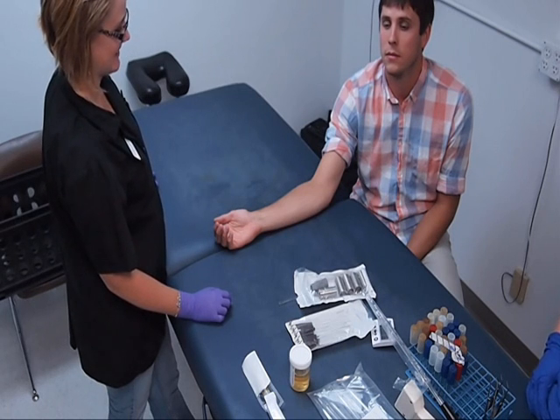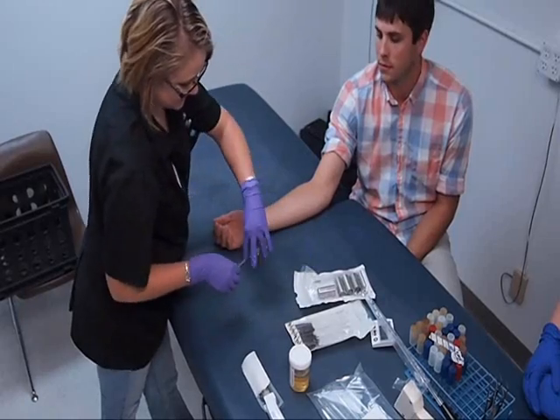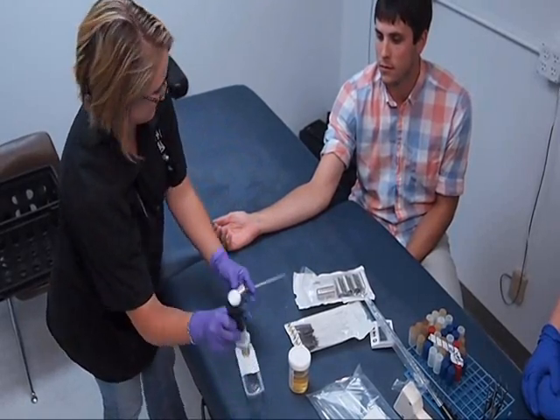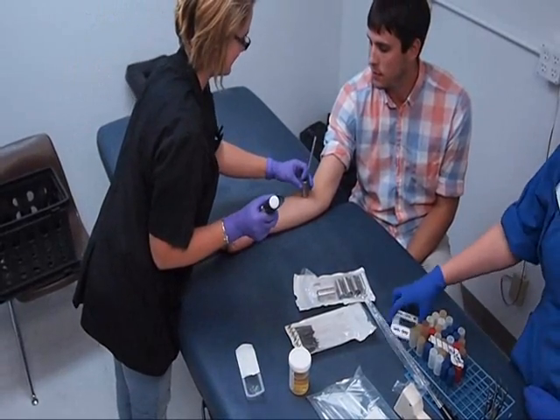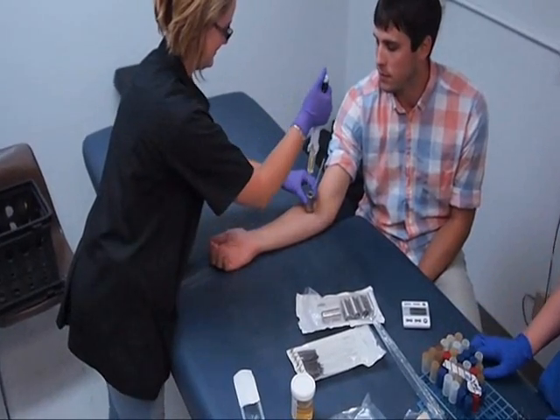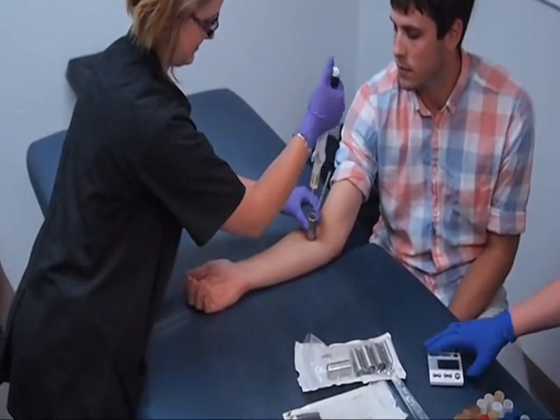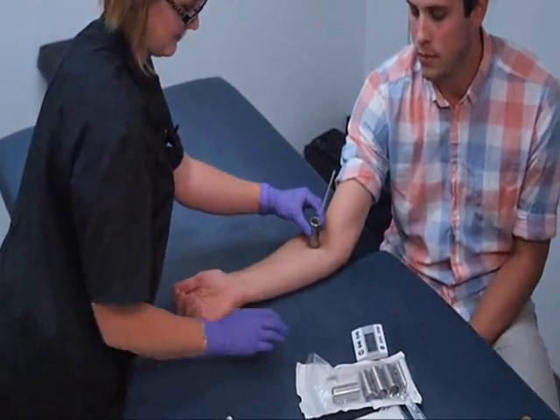This is the cylinder sampling method. A sterile cylinder is held firmly to the test site to be sampled. Neutralizing sampling solution is dispensed into the cylinder using a repeating pipetter with a sterile tip.